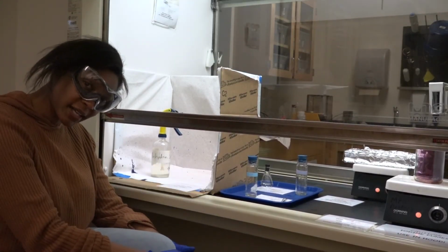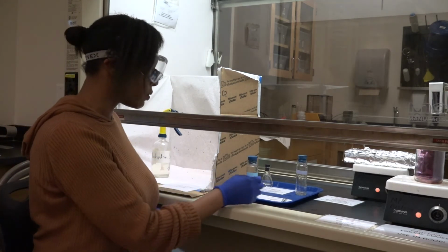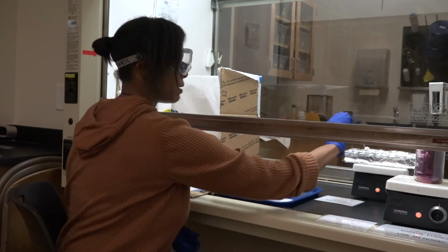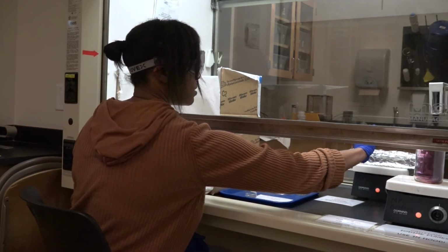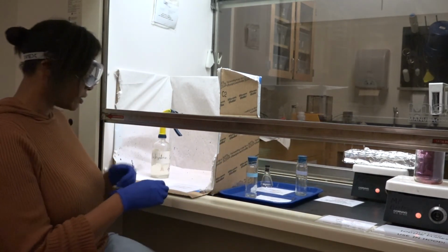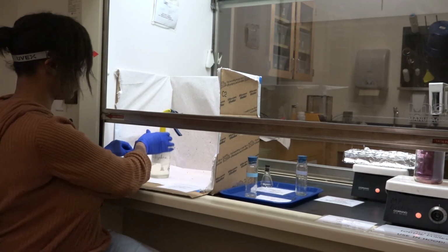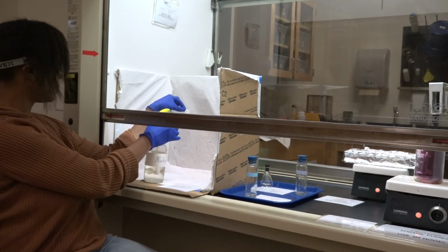Okay, welcome back to the hood. We are about to spray ninhydrin onto our dried amino acid strips, which are here on our heat block. So I will just move these a little bit closer. And again, we're using the hood because we don't want to inhale ninhydrin at all. I'm going to spray liberally on our test strip.